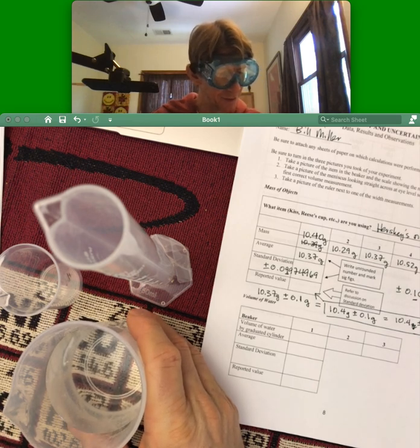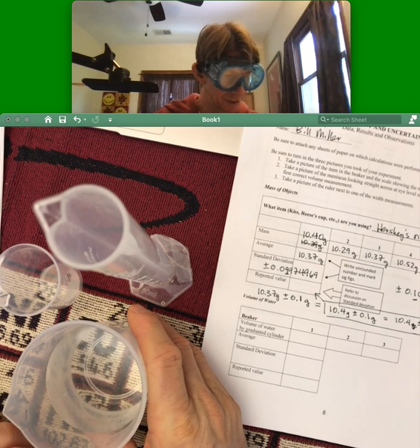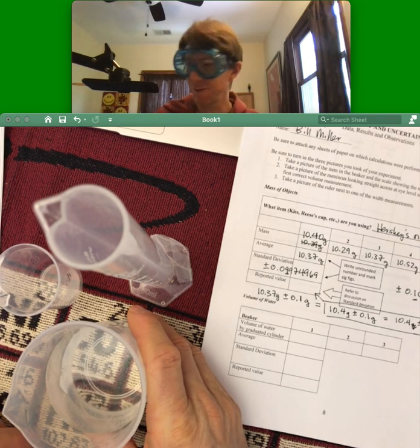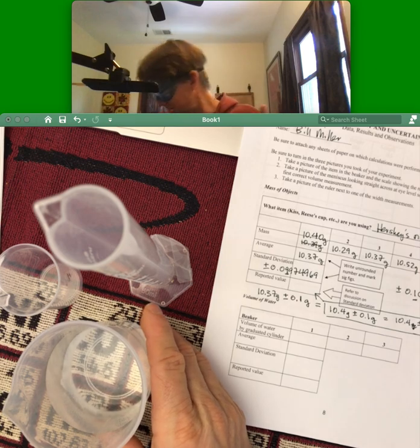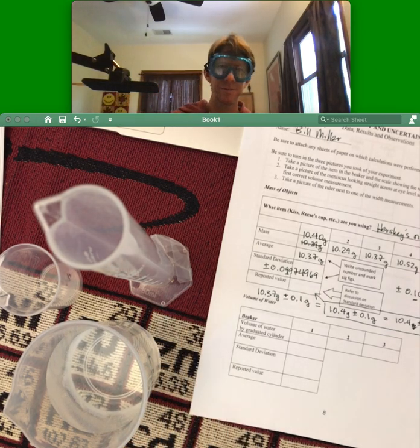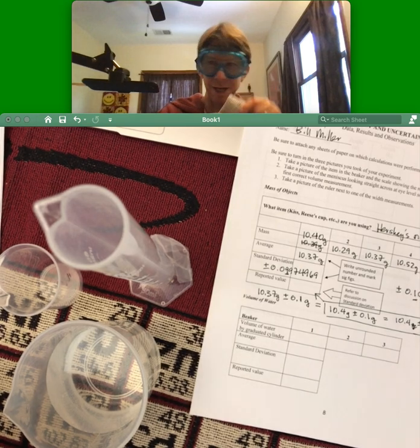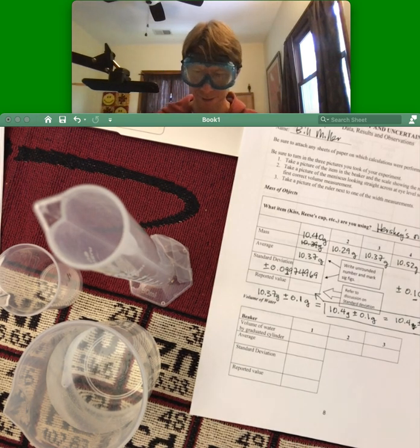The first step says pour 25 milliliters of deionized water into the dry 250 milliliter beaker. I should mention that I also have a cloth here to dry the beaker, and I'm going to need that in a few minutes.